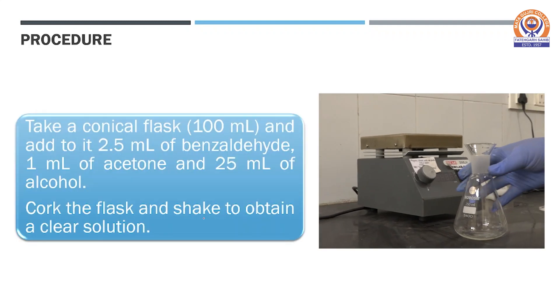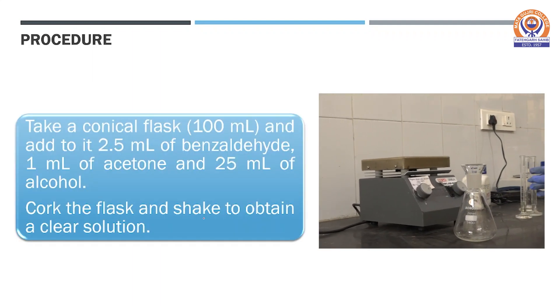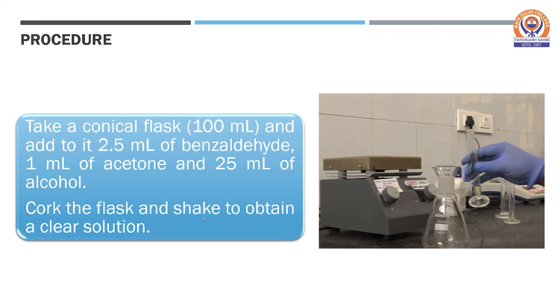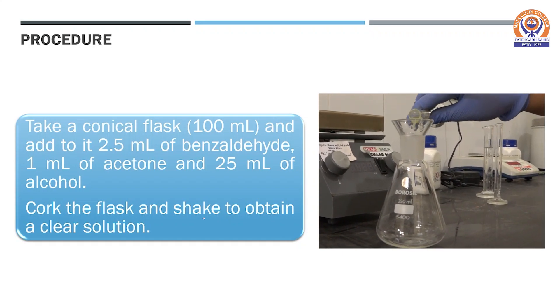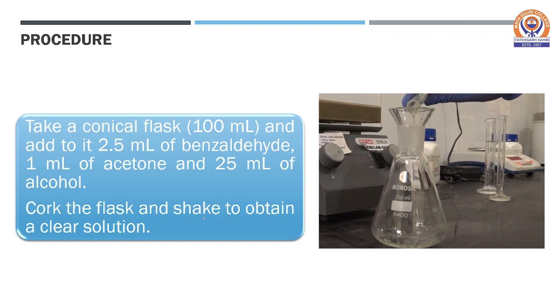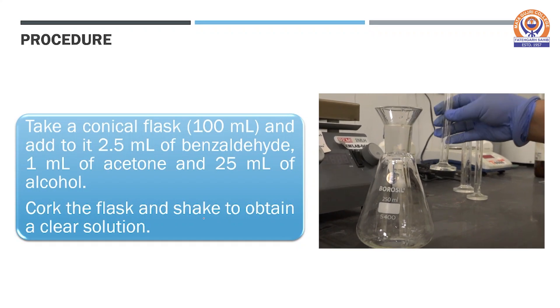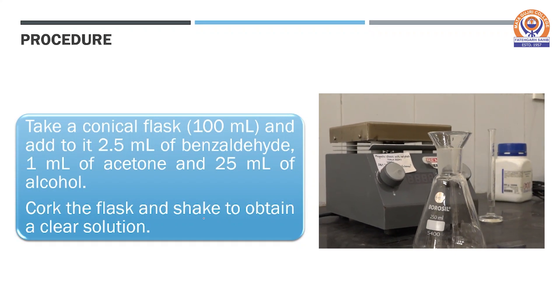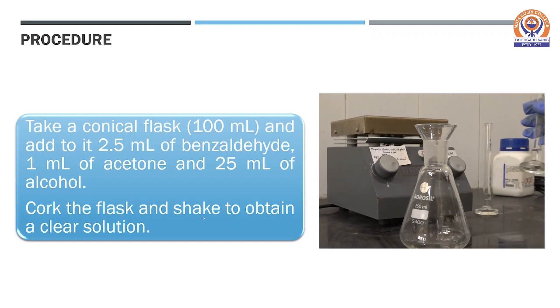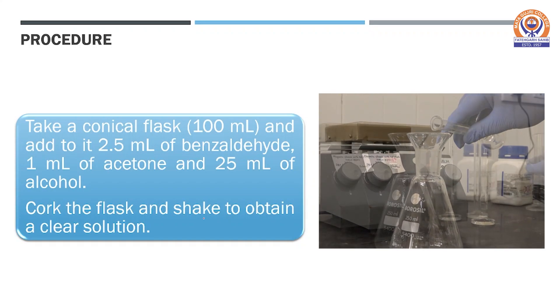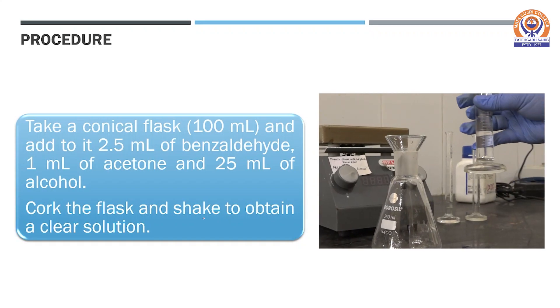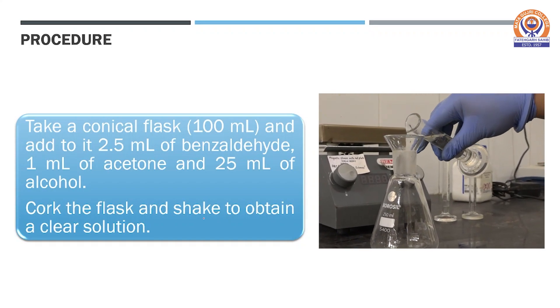Let us now see how to proceed for the synthesis of DBA. In the first step, take a conical flask of about 100 ml capacity and add to it 2.5 ml of benzaldehyde taken in a measuring cylinder, 1 ml of acetone, and 25 ml of alcohol.